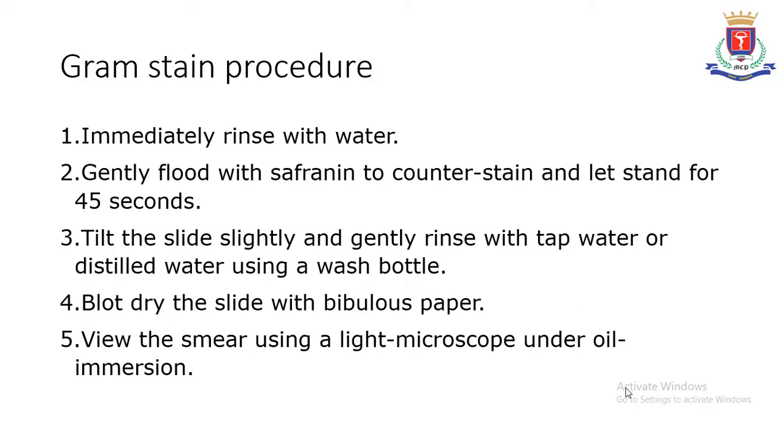Immediately rinse with water and then gently flood with safranin to counter stain and let it stand for 45 seconds. Tilt the slide slightly and gently rinse with tap water or distilled water using a wash bottle. Blot dry the slide with bibulous paper. View the smear using a light microscope under oil immersion lens.